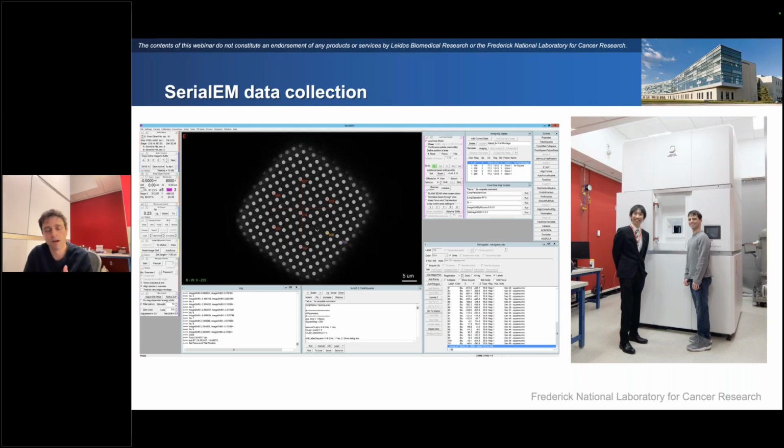And I remember when I heard that we were getting the JEOL microscope for here, I was so nervous because my whole career I had only worked on Thermo Fisher FEI microscopes, and with the Thermo Fisher FEI microscopes, the software, like the user interface on the microscope, is all similar. So if you know how to work one, you kind of know how to work all of them. So I worked mostly on the Cryos, but I also spent some time on the Polara, T12, that kind of thing. But when I heard that I was working on JEOL, I remember what people had told me about working on JEOL and how it was so difficult and so different from working on a Thermo Fisher microscope. I was very, very nervous going in that I wasn't going to be able to do a good job.